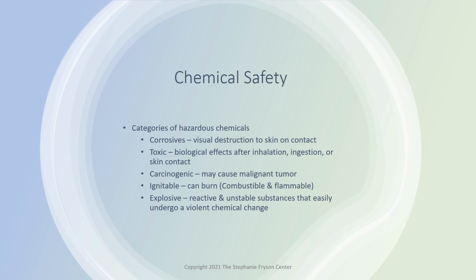Just so you can be aware, there are various categories of hazardous chemicals. They can be corrosive, toxic, carcinogenic, ignitable, or explosive. And you just have to basically know that. You won't have too many questions on these.